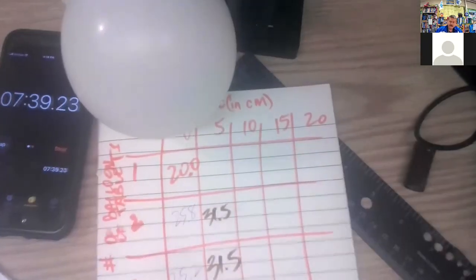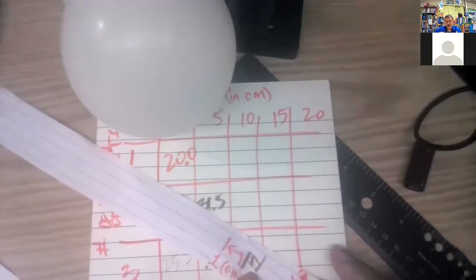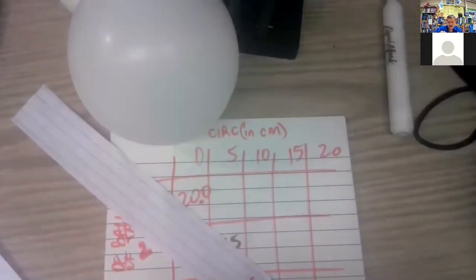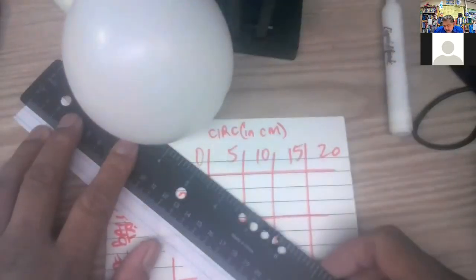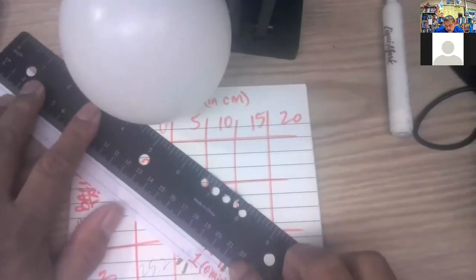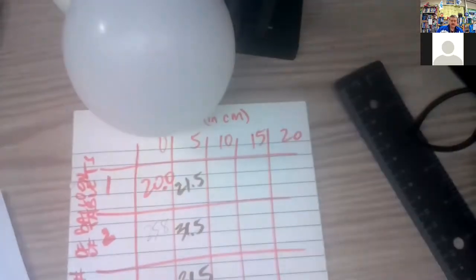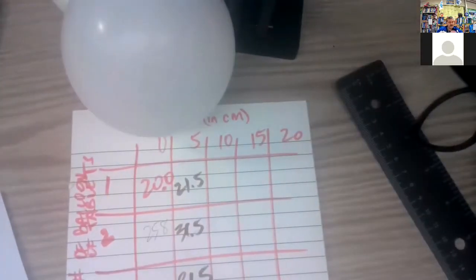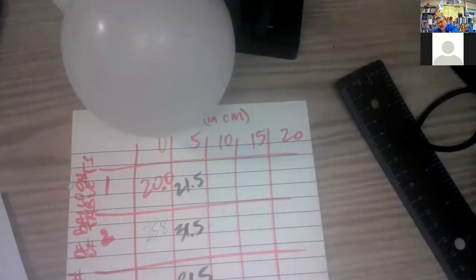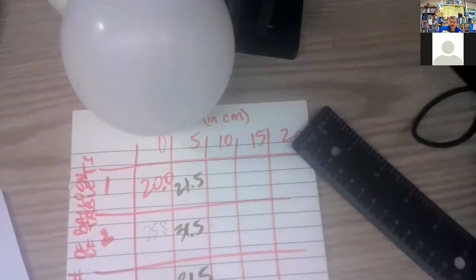And 31.5. And this one right here, for the first one. Let's see what that is. Looks like 21.5. Oh, off screen. Looks like 21. Call that 21.5 right there. 21.5. So we need to take some measurements at 10, 15, and 20. And then we'll have the data and we'll give you the chance to analyze your data.